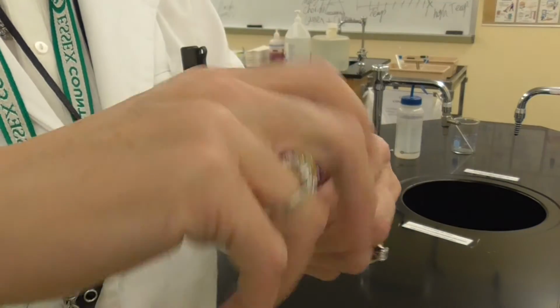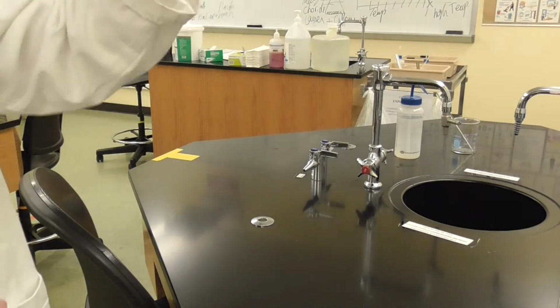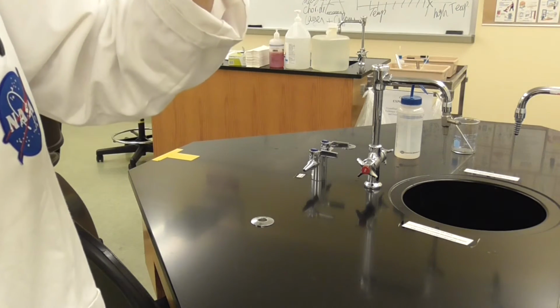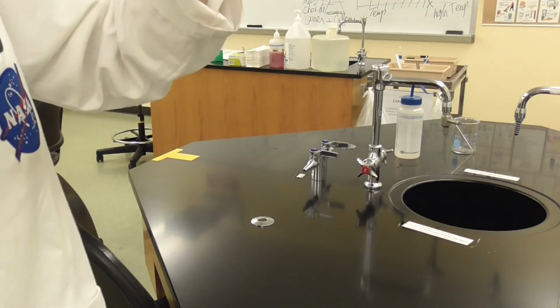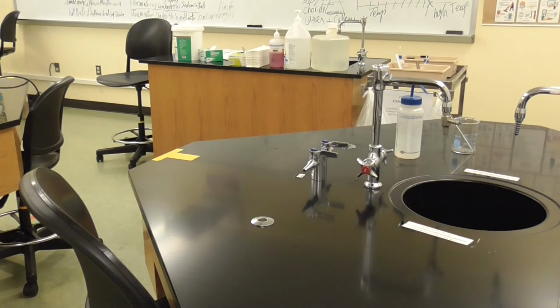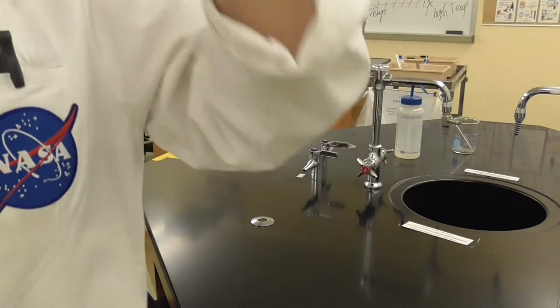Cap the tube. And then we're going to mix it, trying to dissolve it 100%. If it is not dissolved, as you can see, it requires some more. I'm going to take it to the vortex to mix it.